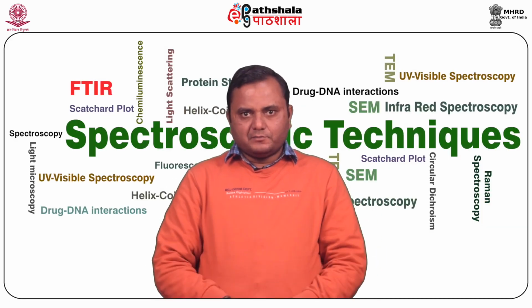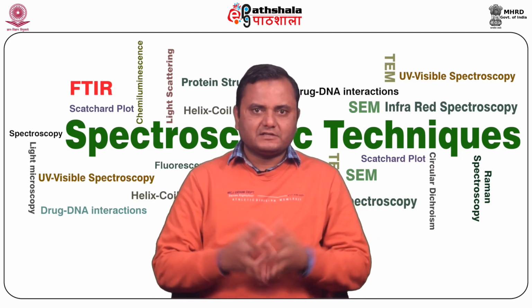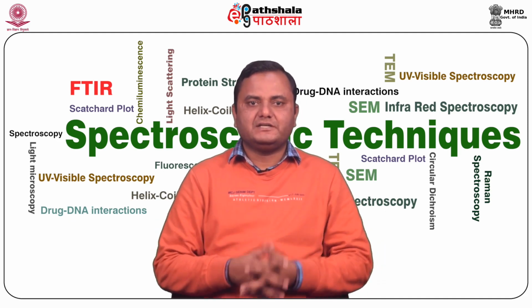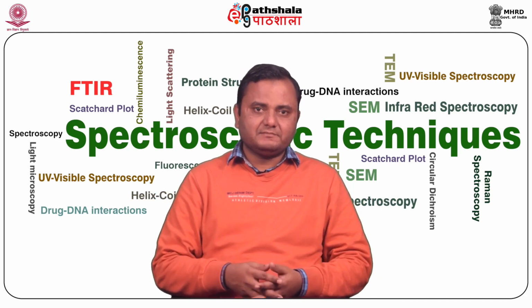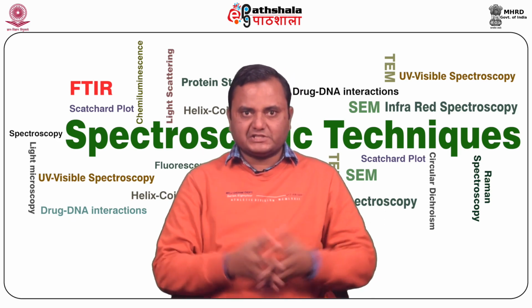The other important component, although it is not part of the spectrofluorometer but is used for the study, is the cuvette. It should be a fluorescence cuvette, a special type of cuvette, and it has 4 transparent sides. It is generally made of quartz, but may be of glass, but a quartz cuvette is preferred because of its very low absorbance and other advanced features.